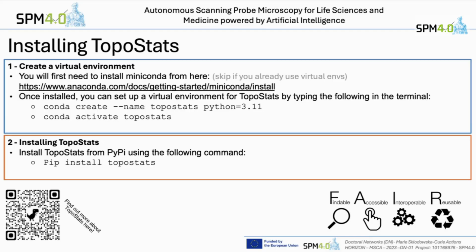Have you picked the right one, by the way, as well? Are you on that? Yes. I'm still installing. Is yours going? Yeah. Excellent. Yours going as well? A lot better than expected. Have you installed it yet? I'm one computer ahead of you guys. I'm on both systems.